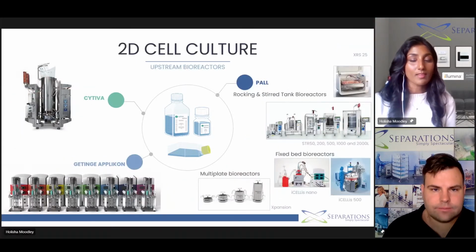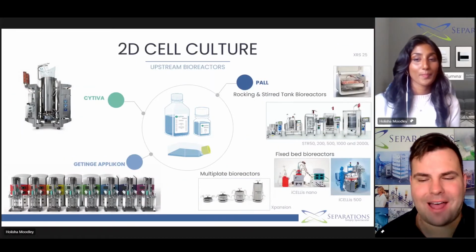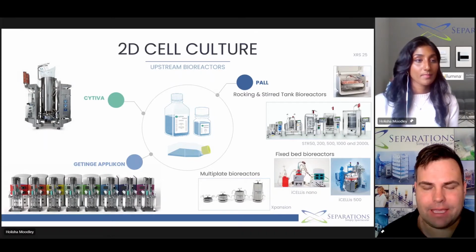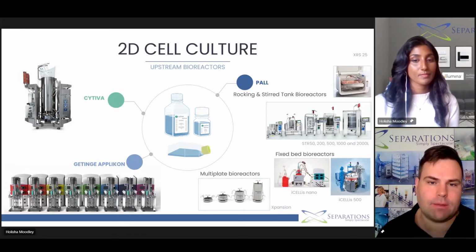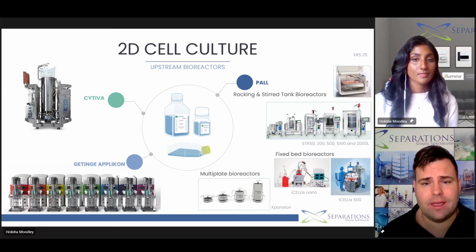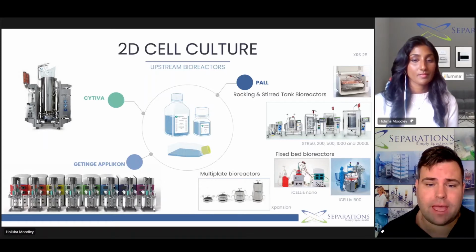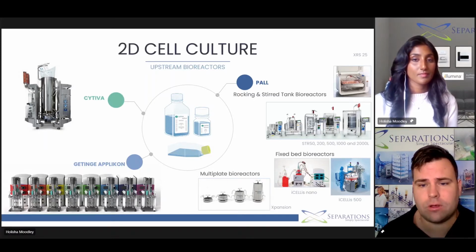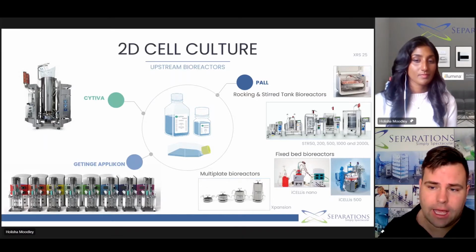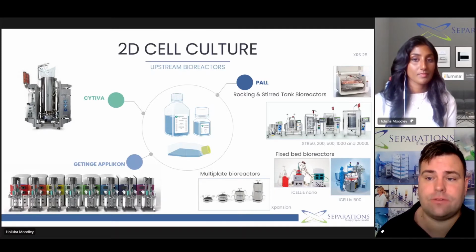Awesome, excellent. So I see here some bioreactors, so I'll maybe jump in on this slide. Often what we see, even at a university level but also commercially, is that when someone starts to move away from tissue cultures, it's just very laborious to have a stack of flasks in your incubators, plus you need multiple incubators. So we start to move towards this framework of looking at bioreactors, whether that's at the bench scale all the way to fully 2,000 liter bioreactors or fermenters.